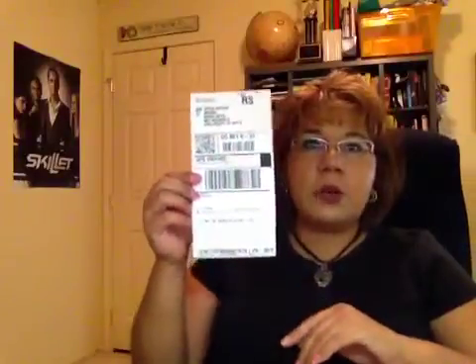When you first unpack your box, there are a couple things you're going to see sitting on top of the actual kit. The first thing you're going to see is something that looks like this — it's a return shipping label in the event that you need to return your kit to the company. This kit includes a return label; it's actually two sheets, pre-addressed to the company. So don't get rid of this — you might need it.